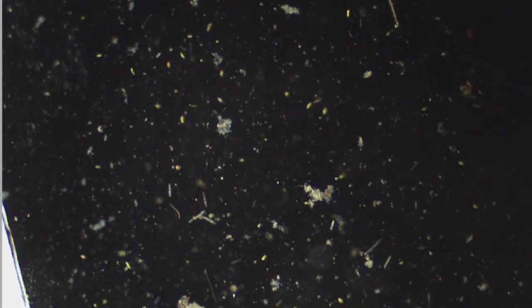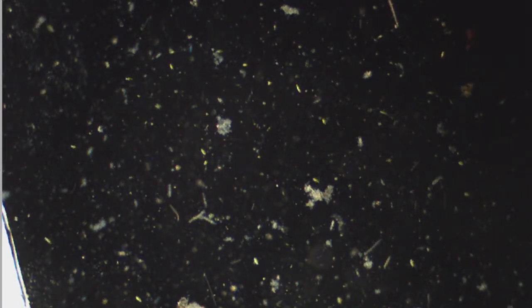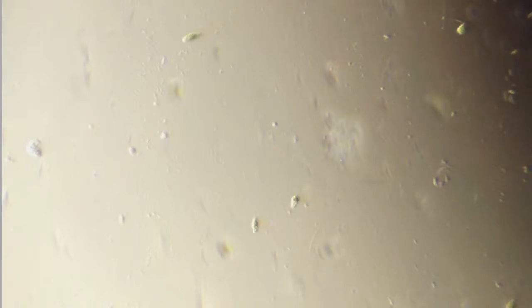Oh man, there's all kinds of stuff in here. All kinds of goodies. Looks like some Euglena flipping around. Let's take a look-see. Yeah, got some nice Euglena. If you guys don't know Euglena, it's one of these weird animal plant hybrid thingies. It's an animal with chlorophyll. So it can feed, or it can make its own food from the sun. Very cool.